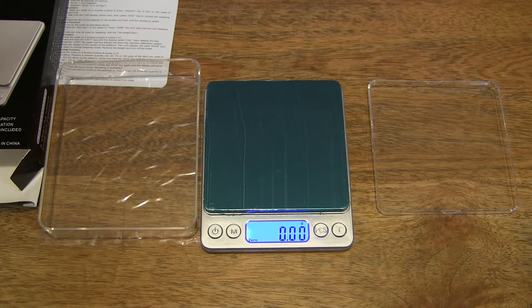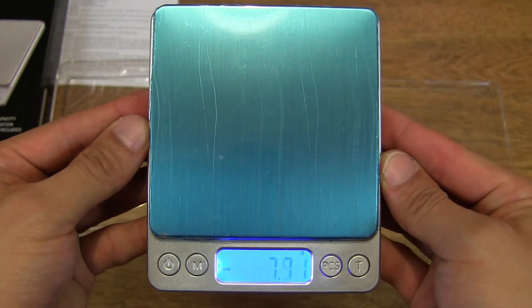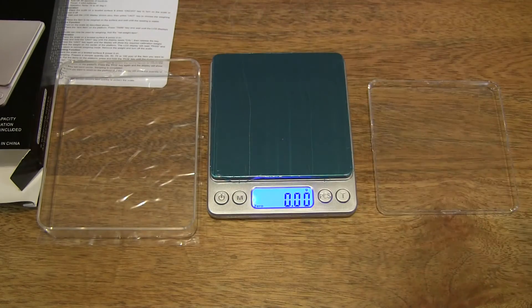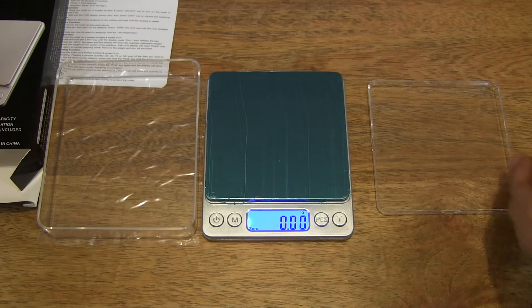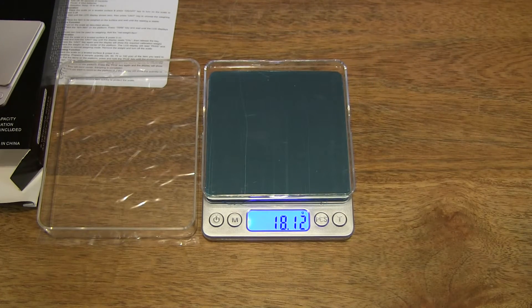It's showing zero grams, which is quite nice — so there's no need to reset or set the tare weight. Let's set it back down, once again showing zero as you can see clearly on the display. Let's go ahead and put a small tray on it and see how much it weighs — 18.08 grams.